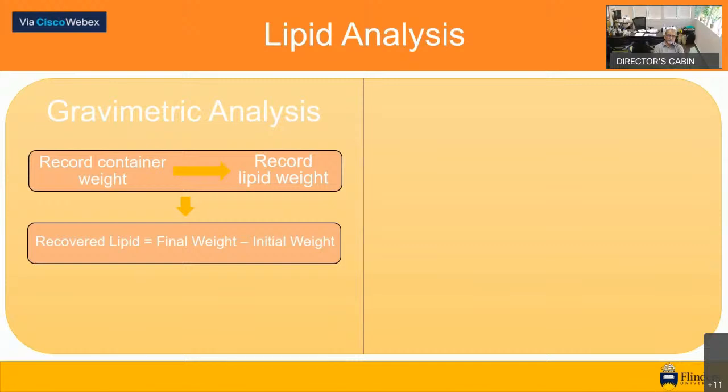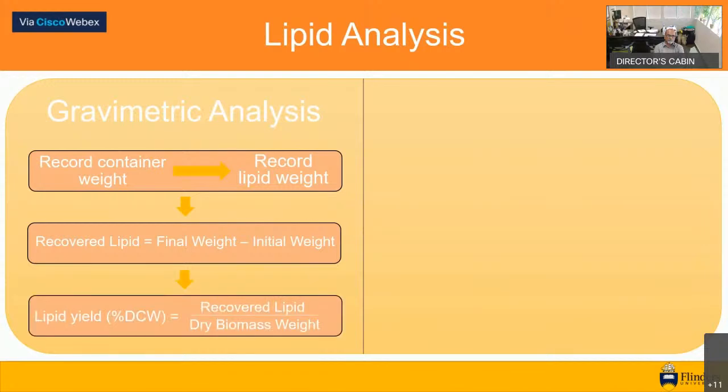FAME-GC analysis may then be performed on the lipid extract. This should be performed as soon as possible after extraction to prevent oxidation of polyunsaturated fatty acids, with storage at -20 recommended until FAME-GC can be performed. The lipid extract should be dissolved in toluene to allow the conversion to FAMEs. To this we add BHT solution, internal standard, and acidic methanol. The BHT is an antioxidant solution which reduces oxidation of PUFAs during the conversion process.